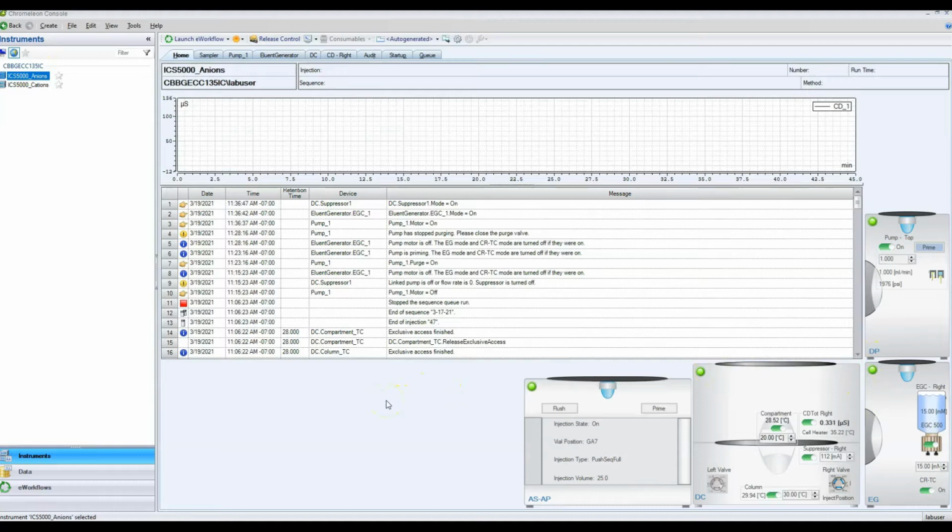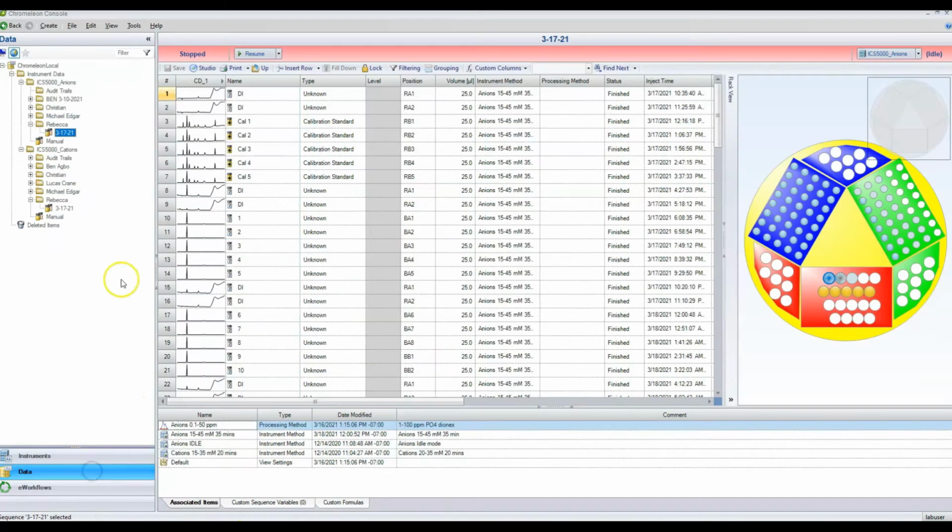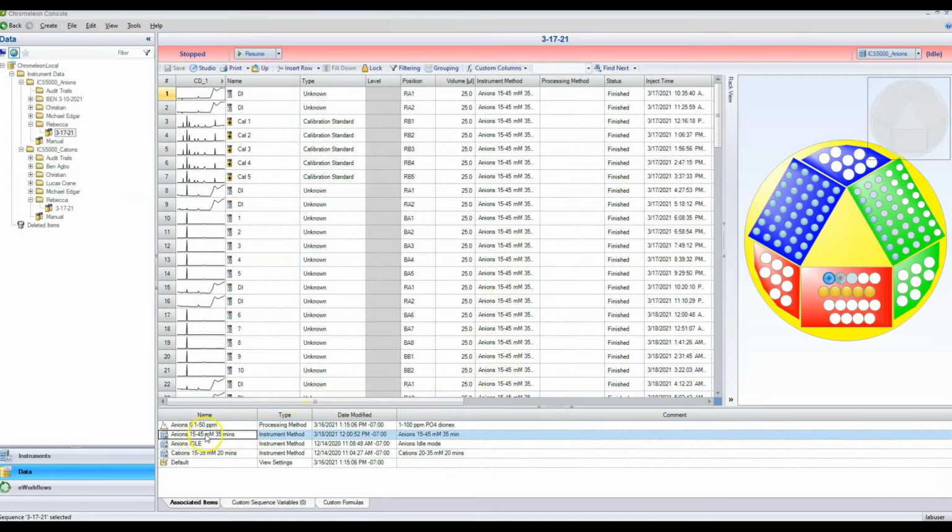So if you do plan on using a different run program than anyone else, you can find that run program in the data tab for your samples, open it, and dig through it to find what you want. So again, this is not super important if you're just measuring normal anions and cations. So most likely you'll just need to remember these numbers that I just said, but I'll show you how to do that right now, for example, for this anion. So I'm going to go to data, find an anion run that uses the anion processing method that I want, or instrument method. I'm going to open it up right here.